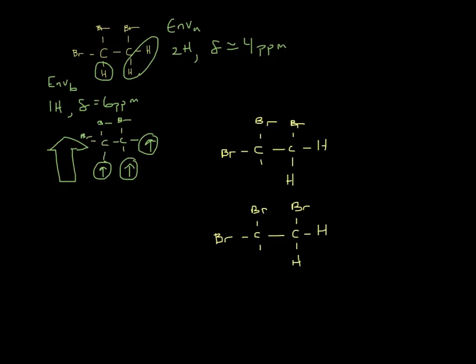If we look at our environment A, there's two possibilities. Either they could exist in that NMR where their neighbor was reinforcing that magnetic field. So think of it as that hydrogen was spinning around so that that magnetic field lined up with your big magnetic field. Or it's also possible you'd have a 50-50 shot of that magnetic field of the neighboring hydrogen pointing in the opposite direction, basically pointing down instead.